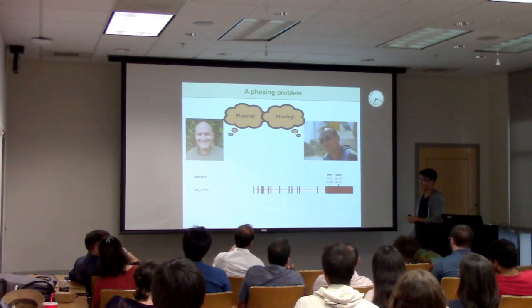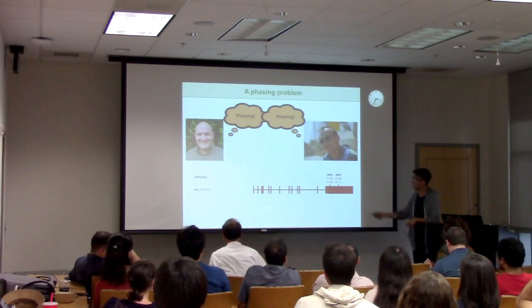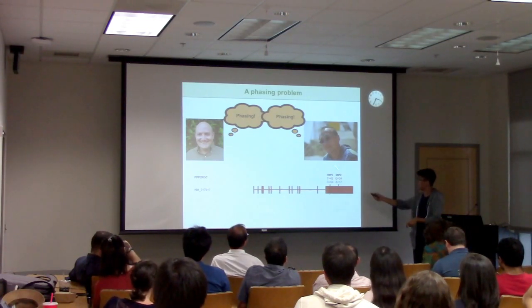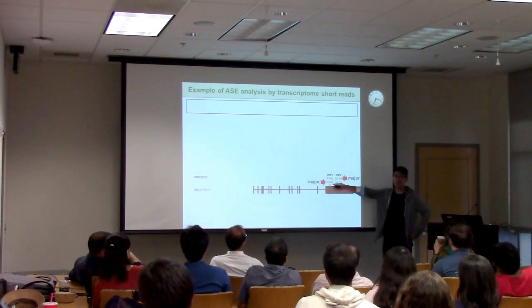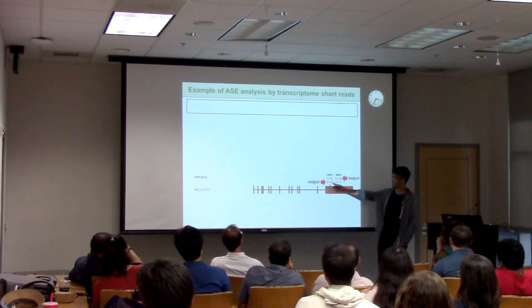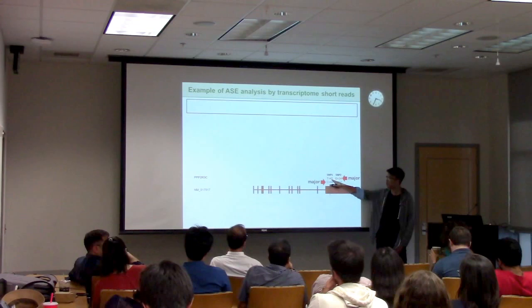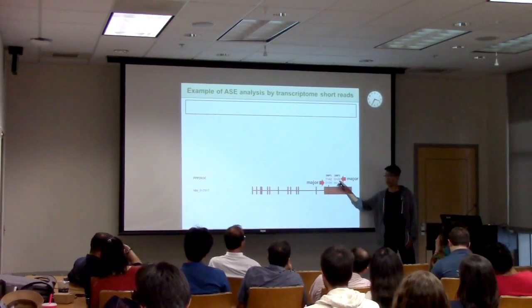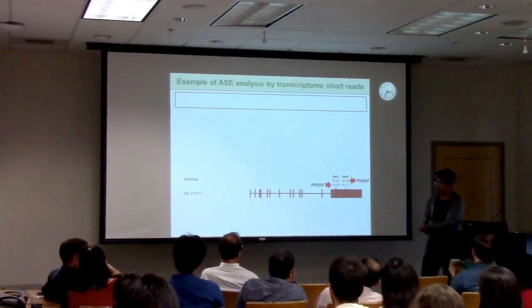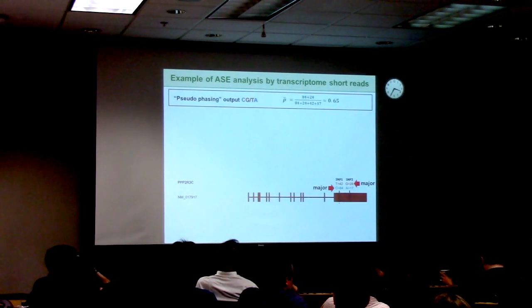Oh, you colored it already. Oh, yeah, right. I'm so sorry. Because this is part of our publication, so we already colored it. But let's check. In SNP1, the major allele is C because you have 84 reads supporting C and only 42 reads supporting T, right? So this is the major, and at SNP2, G will be the major. So if you make a reasonable guess without this color information, CG and TA will be the pair of haplotypes you will guess. That's a very reasonable guess, right?